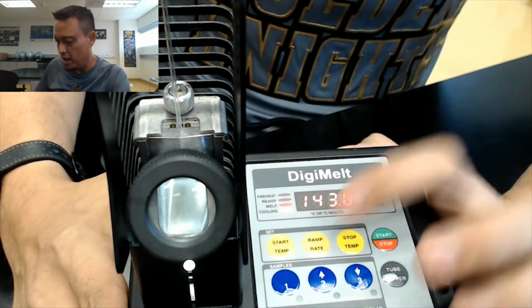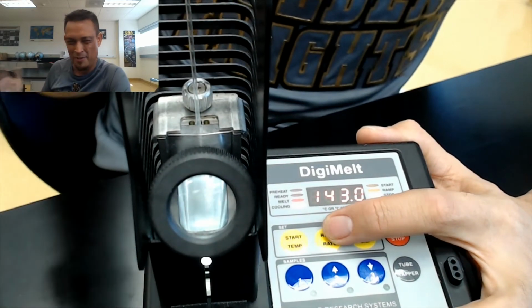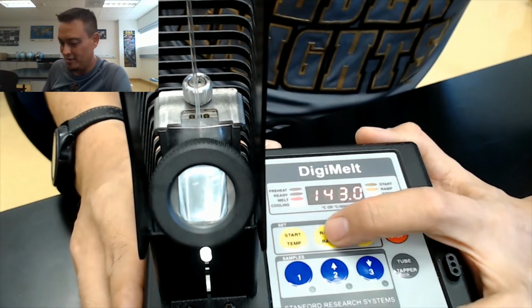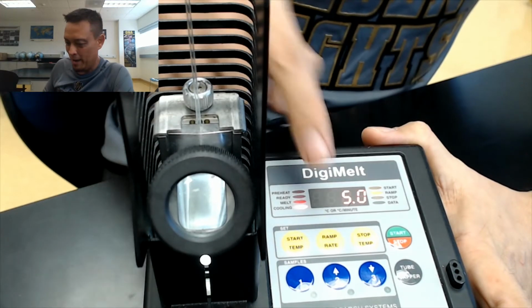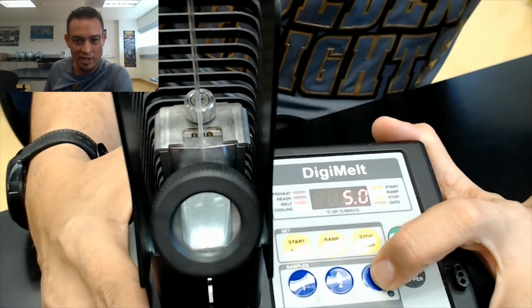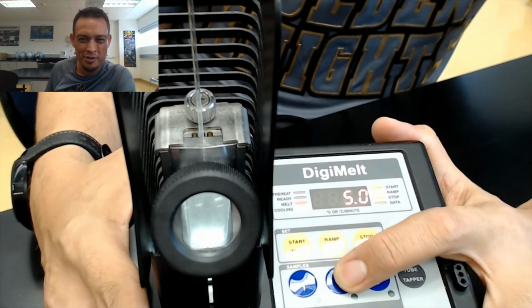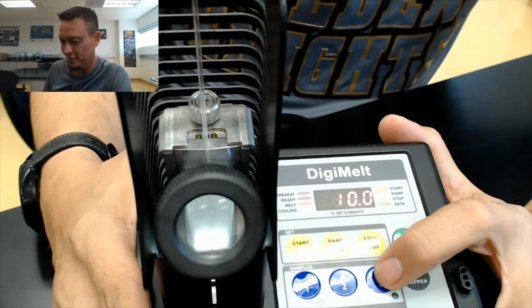All right, the ramp rate, if you read the procedure, it says you want to try to go for a ramp rate at about 5 degrees C per minute. And I pressed the ramp rate button, it's already at 5, but if you wanted to adjust it for any reason, you can change how fast. Like super slow, normal, and then kind of fast is basically your settings here.